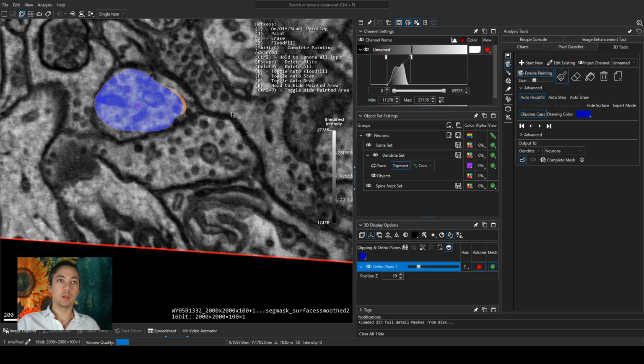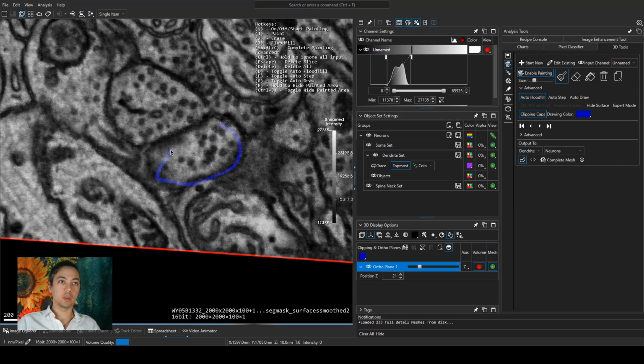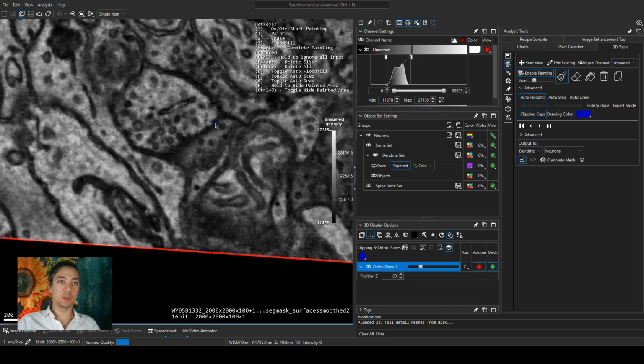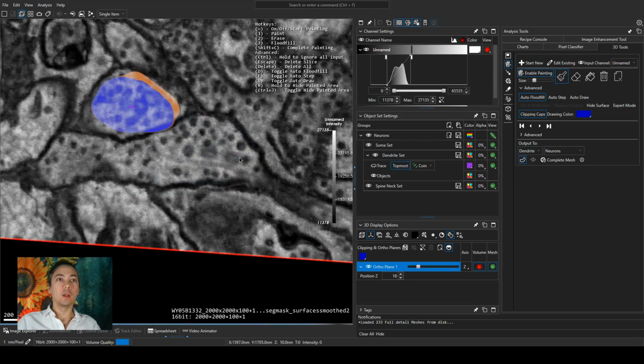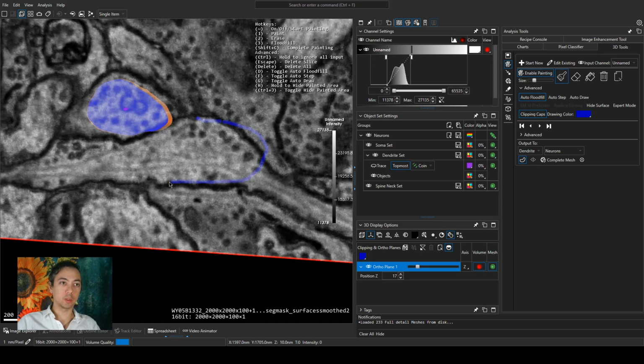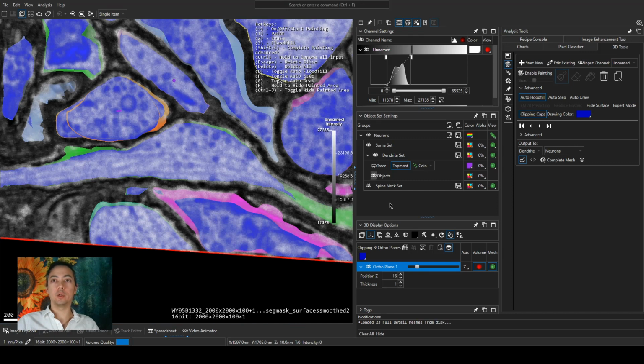You can also, yeah. And then I'll just sort of paint, and then paint this one, and this one, and this one, and this one. Probably those are attached, huh? And then maybe go down and paint some of this one. Oh, actually it belongs to this big long piece. But you get the general idea. So we do that, and then when we complete this one, you'll notice that it's in a similar situation.